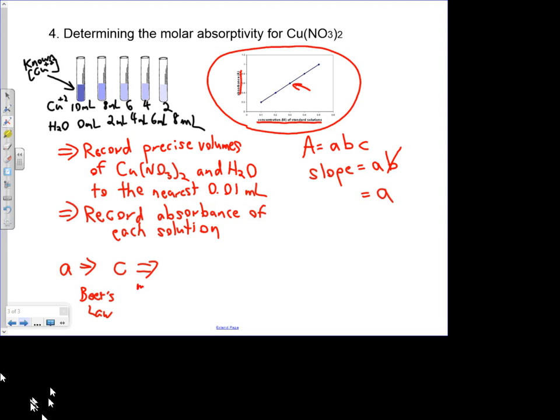We're going to multiply by the volume, so 50 milliliters in that Erlenmeyer flask, to find the moles of copper in our original brass object. Then we're going to use that to find the mass of copper in our original brass object, from where we can find the percent mass of copper in our brass object.